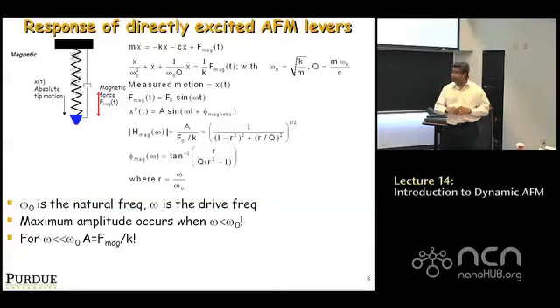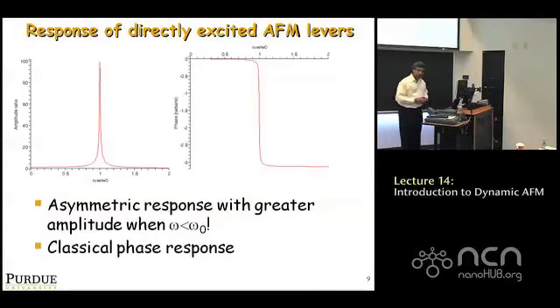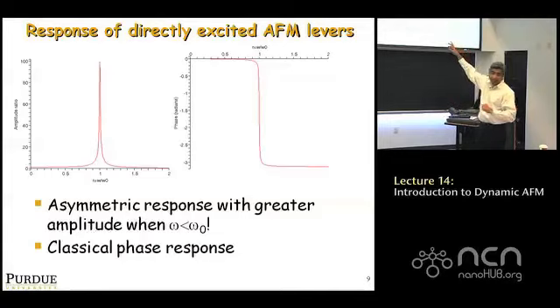So if you were to plot this response, you get something opposite. You find that this ratio at low frequencies is actually 1, but at high frequencies it decays to 0, right? So it flips. Acoustic versus magnetic or direct excitation flips, okay? And the phase response is really classic. This is the absolute phase that's plotted. It's negative, which means there's a lag. And this is the response, okay?